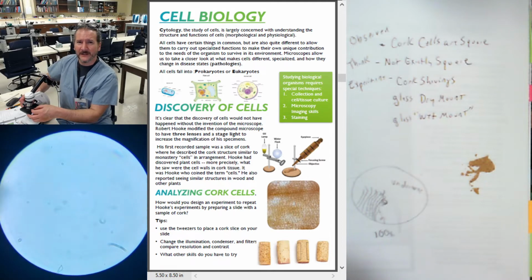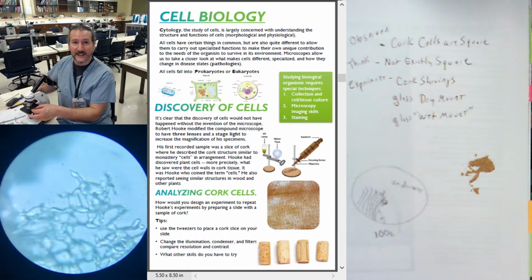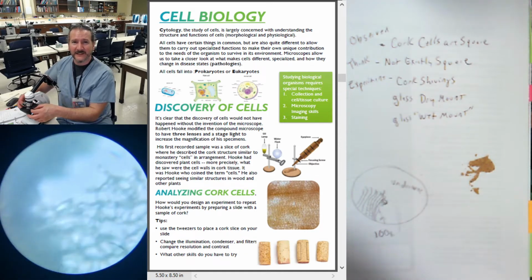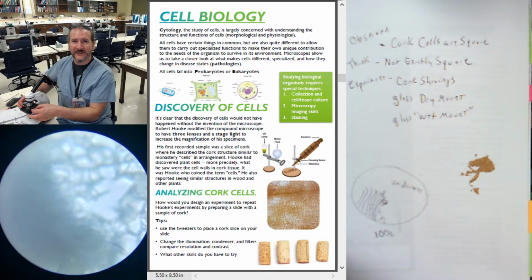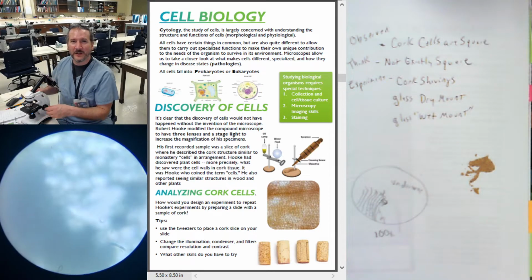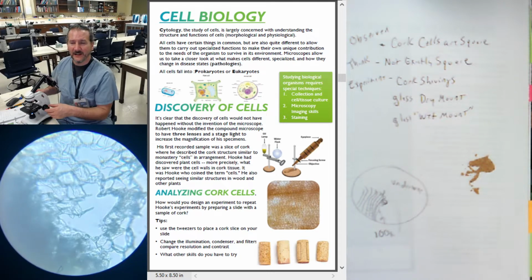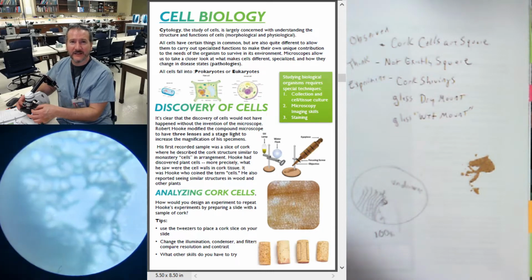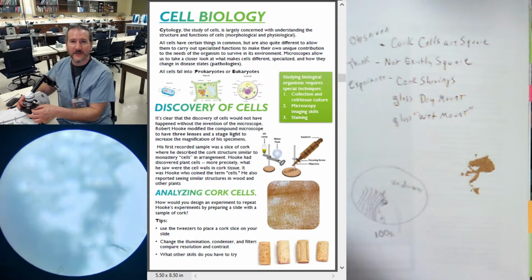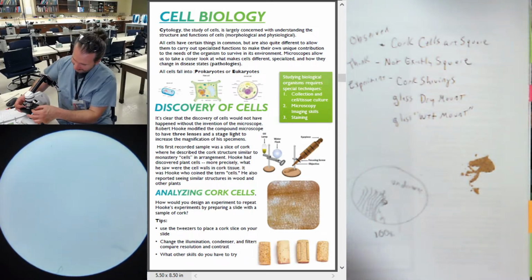Slide it over. Come on this way. Oh, every time I go to the stage, it moves back just a little bit. Move it up a little. Too far. Down a little. So if you really enjoy the microscope and you want to get a different one, my suggestion is you get one that has stage knobs. That's really like an Etch-a-Sketch. Because you turn them, they'll move the stage forward and backwards for you precisely, without worrying about your thumbs messing everything else up. Like me and my fat thumbs.